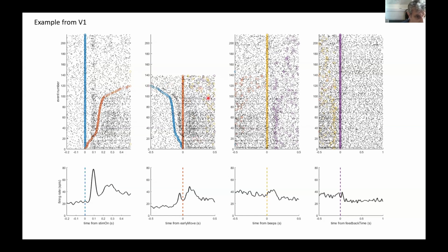But now you also see something here, that you've got this broader peak, this activity that follows the movement. And that's because this cell in V1 also correlates with the movement of the wheel. So as you know, these sorts of recordings plentifully illustrated, even the primary cortices have lots of correlates of bodily movements, and we're going to see that again and again.